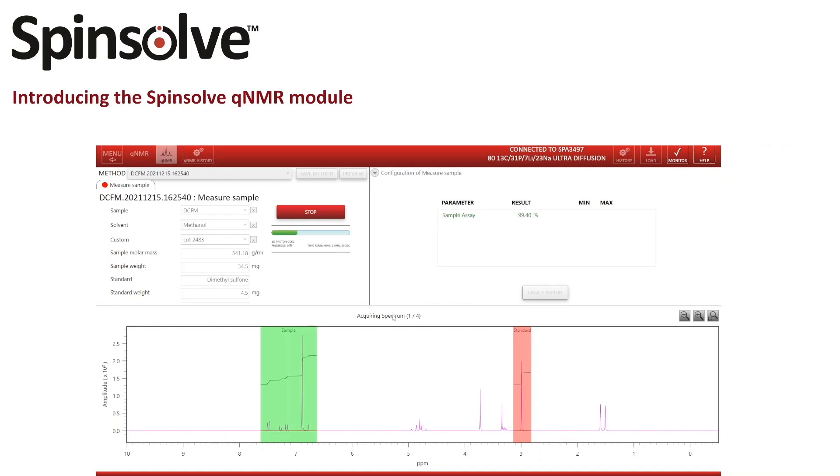Although in this video I use a method with an internal standard, the Spinsolve QNMR module also gives you the option to perform QNMR measurements with external standards. For this topic there is also a recent blog post available on our homepage.